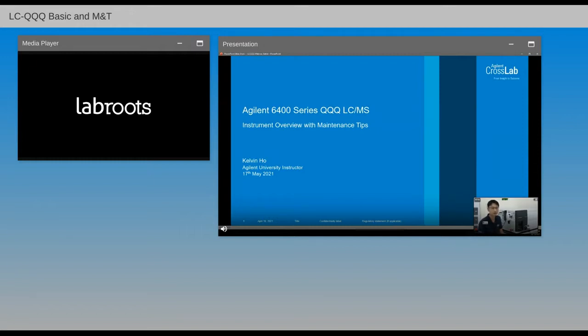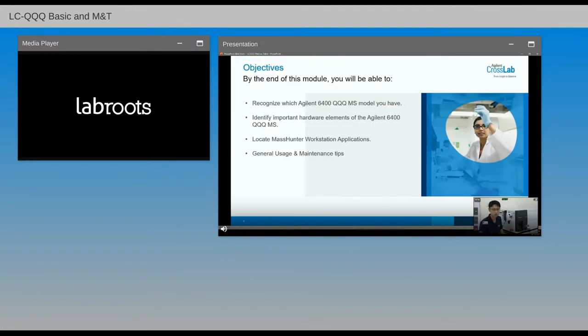All right. Right beside me, you can see here, I have a 6470A series model. Over the course of this short webinar, I'll be introducing to you this 6470, as well as we'll be having a look at the internal of a 6460, an old 6460. Right. So without further ado, let's get to the objectives.